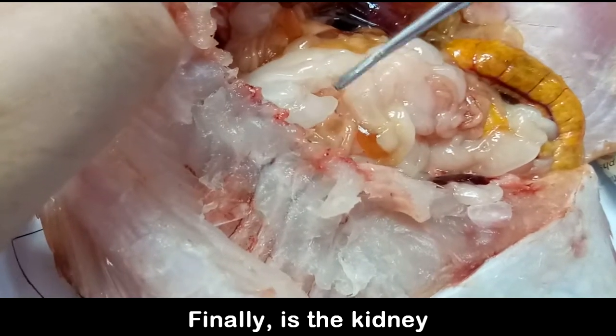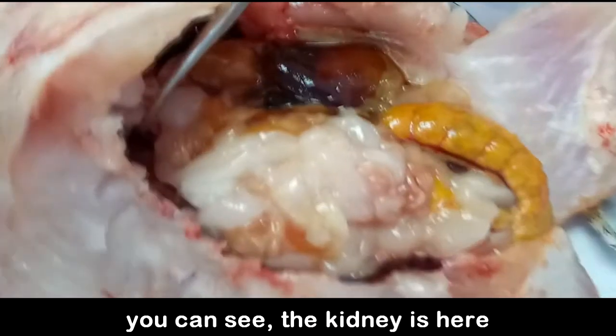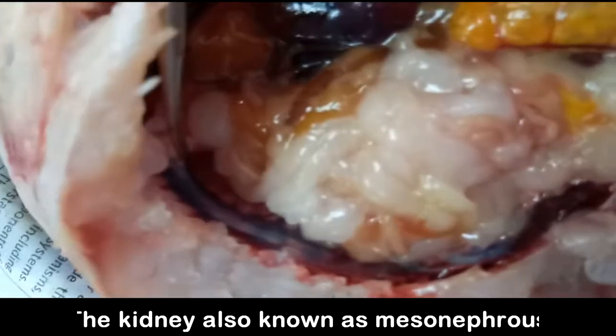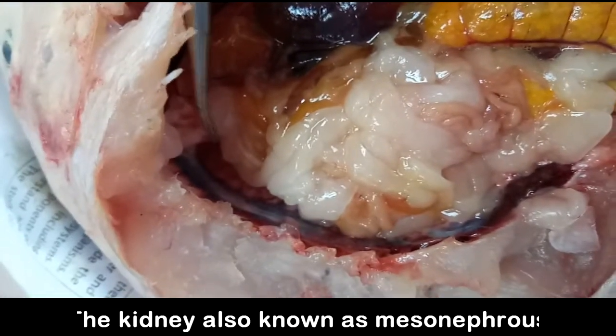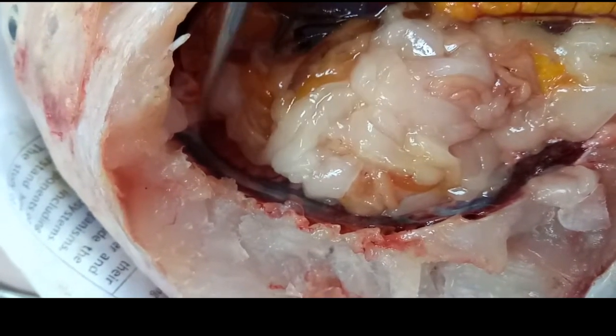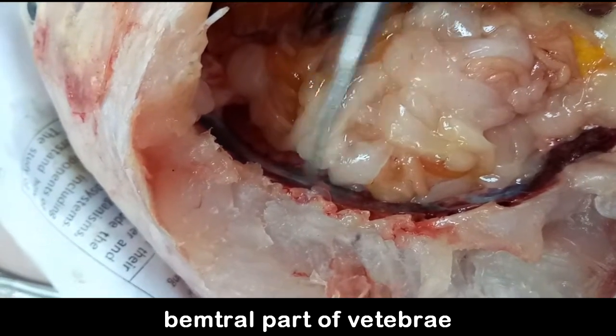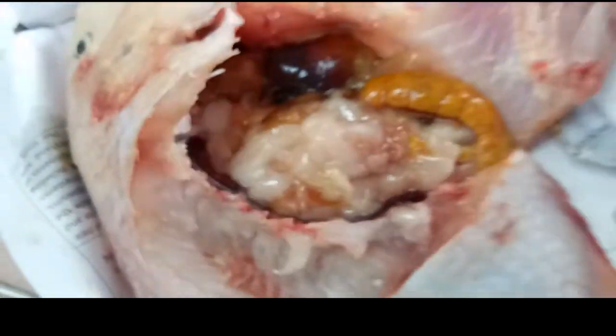And finally, the kidney. So you can see the kidney here. The kidney is also known as the mesonephros. Along here is the kidney. It is dark red along the ventral part of the vertebrae.